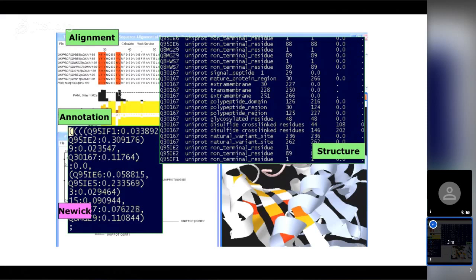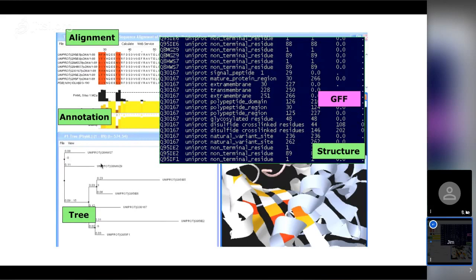Newick — this is quite hard. This is a series of brackets with names of proteins and numbers next to them. This was pretty much the first file format developed for sharing evolutionary information about genes, and it happened over lunch in a cafe in Newick in New Hampshire — so it's also called the New Hampshire format. These are all anecdotes from people in the early 80s working out all these things on computers. For Jalview, there's a built-in viewer that processes these files, and you can export Newick files as well to take to another program.